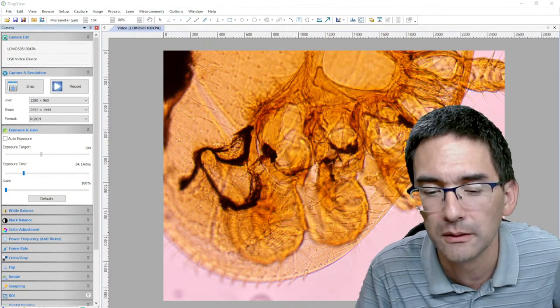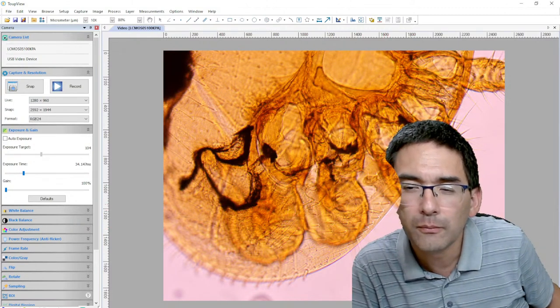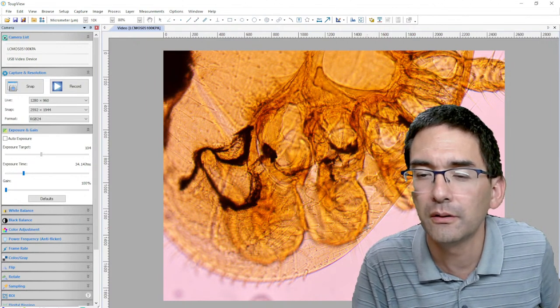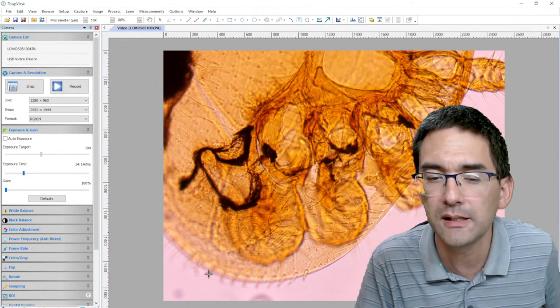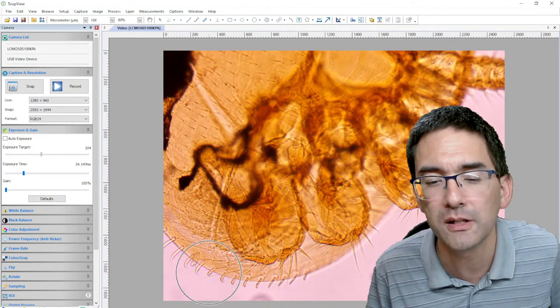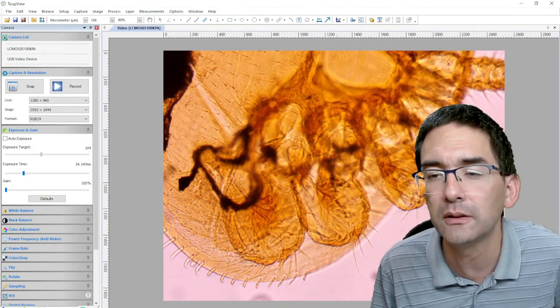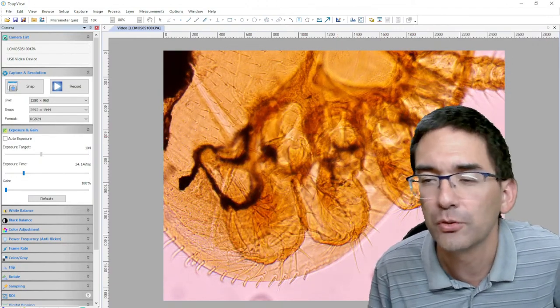Yes. Okay, my head might be a little bit in the way, so maybe I'll move out over here. Over here you see that some parts are a little bit blurry. Also over here, some of those are a little bit blurry. Over here, those are again a little bit more in focus. So it would be kind of nice to just watch this part here as a focus. Yeah, see, now this part is much better, it's in focus. But now other parts like up here are out of focus. So it would be kind of cool if I could get this whole thing processed in such a way that everything is in focus. It's just a demonstration now, okay?